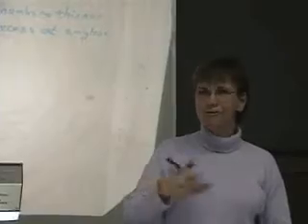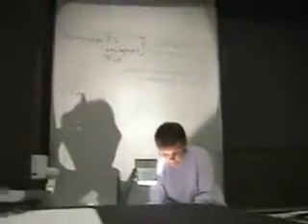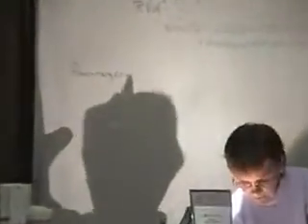Farinograph, mixograph, talking about mixing characteristics. You see why a lot of people call the rheology lab the O-graph lab? Almost everything seems to be something O-graph.